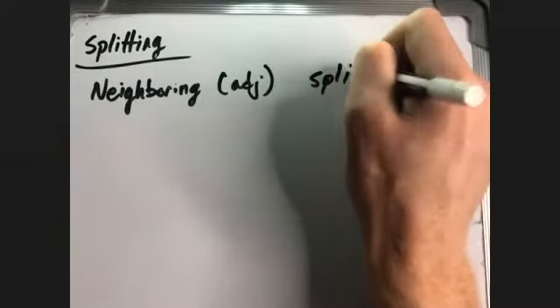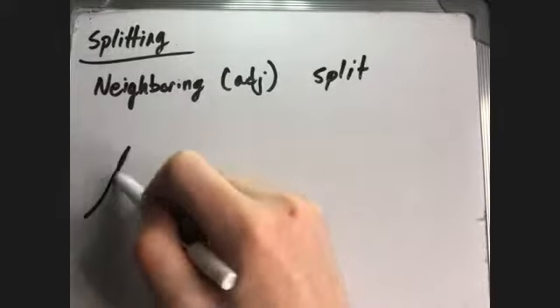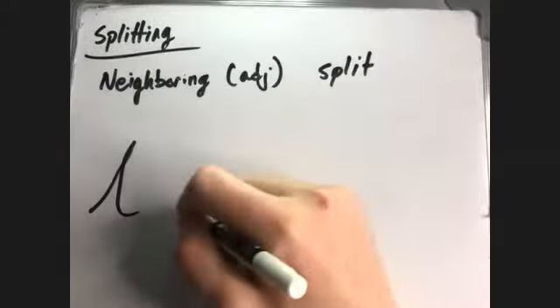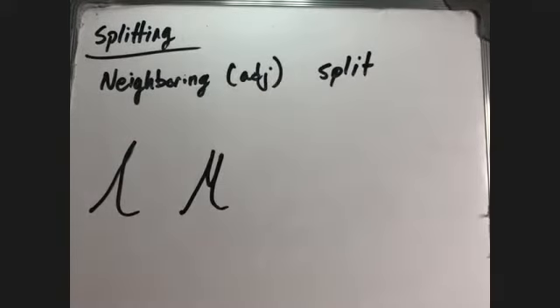And what splitting means is it changes a signal. So this would be just a peak that has no splitting. A split peak would have multiple. It would split the peak into 2 peaks, basically. So neighboring hydrogens have this effect on the hydrogen signal.